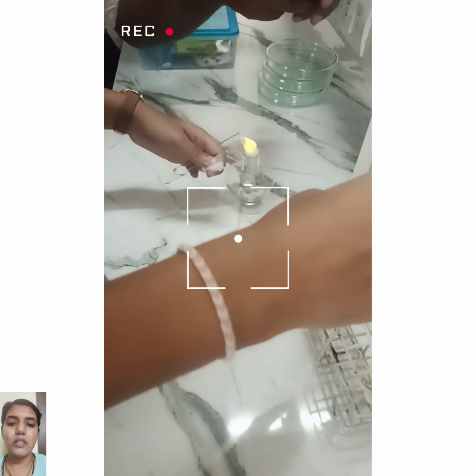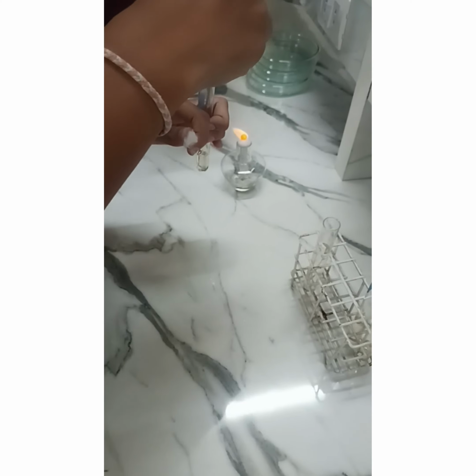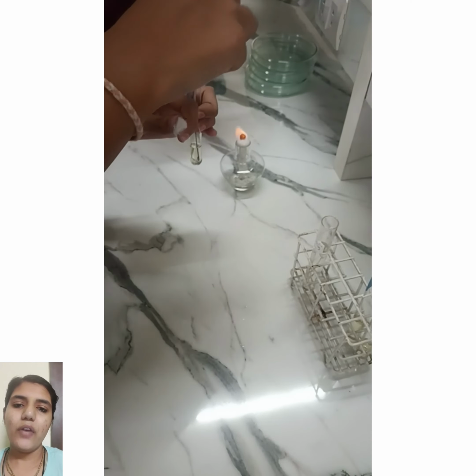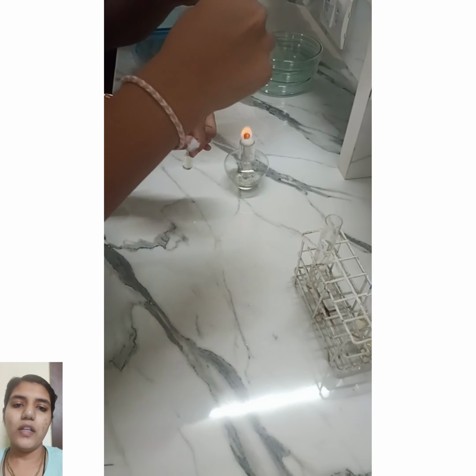So after heating up the test tube and putting the inoculating loop that contains contaminated bacteria in the nutrient broth test tube, stir it for about 10 seconds, and then sterilize both the inoculating loop and the test tube of nutrient broth above the flame to prevent contamination. Close the test tube of nutrient broth with the cap and place it back in the test tube holder.